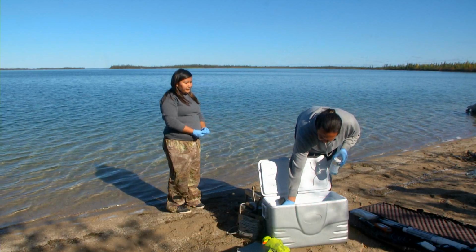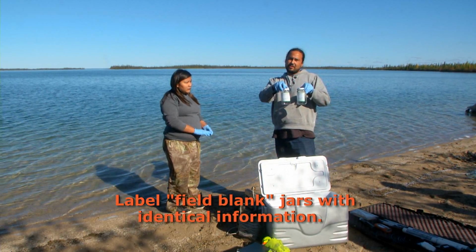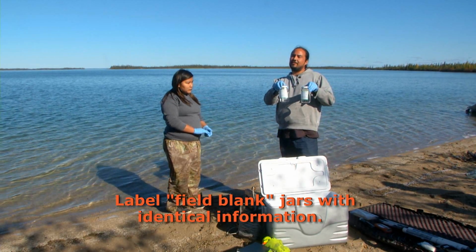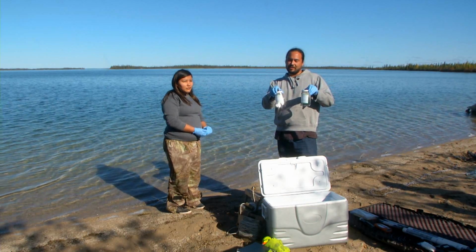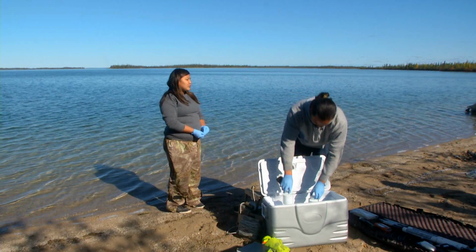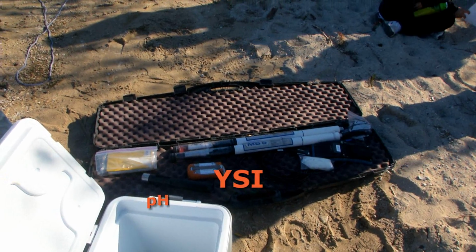And that goes for the field blank. We'll give the field blank the exact same information as a regular one, so they can't tell the difference. So that's the way of testing the lab, to make sure we got proper readings from them and they're getting proper analyzation. And the YSI will tell us the pH.